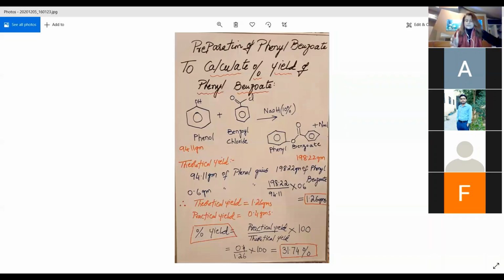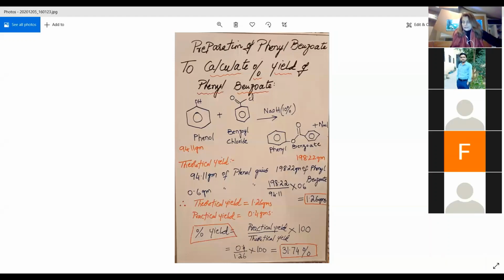Even you can say that all the experiments relevant to your organic synthesis are supposed to be done in one, whenever you are mixing the reagents, whenever you are dealing with the organic solvents, you need a fume hood there, right? The exhaust fan should suck out everything, and only your hands are inside it, and the hands are also with gloves, right? You're not without gloves, you have a mask, you have gloves, so now your hands are inside, and you are not inhaling them, right? Because inhalation simply kills.